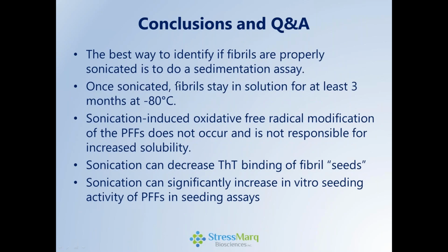The best way to identify if fibrils are properly sonicated is to do a sedimentation assay and see what is in the soluble or insoluble phase. Once sonicated, fibrils may stay in solution for at least 3 months at -80 degrees. Sonication-induced oxidative free radical modification of the preformed fibrils does not occur. This is from data that we haven't shown simply due to the length of this talk, and is not responsible for increased solubility. Sonication can decrease thioflavin T binding of fibril seeds. And sonication can significantly increase in vitro seeding activity of preformed fibrils in seeding assays.